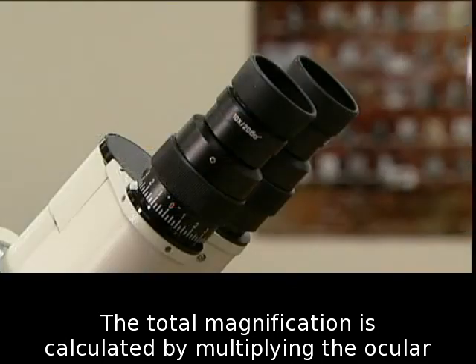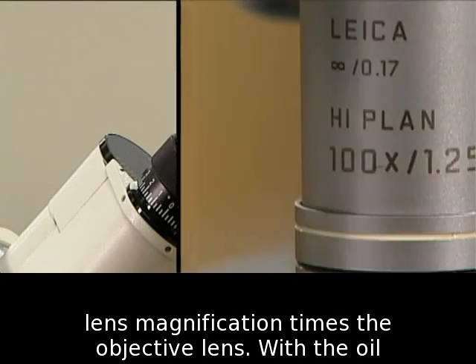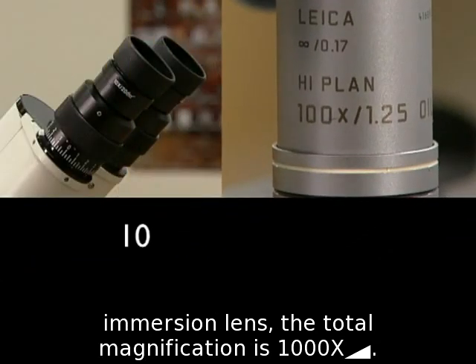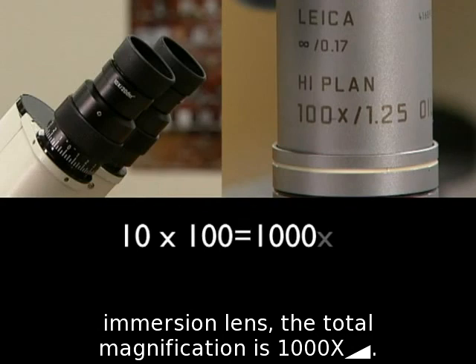The total magnification is calculated by multiplying the ocular lens magnification times the objective lens. With the oil immersion lens, the total magnification is 1000x.